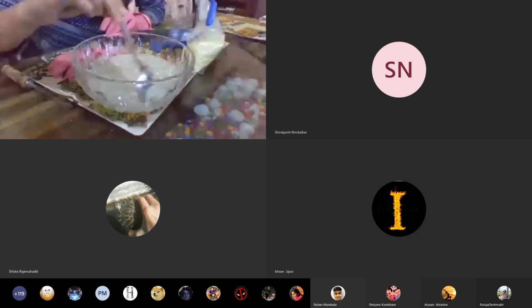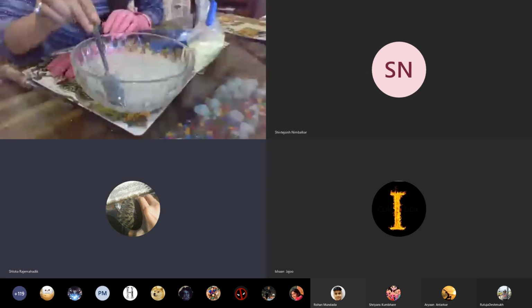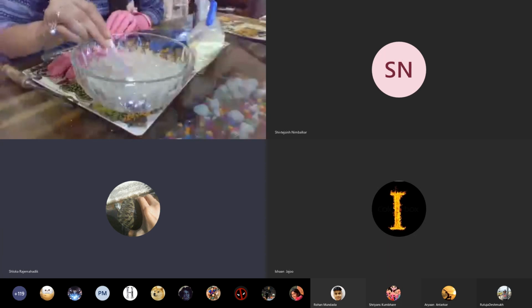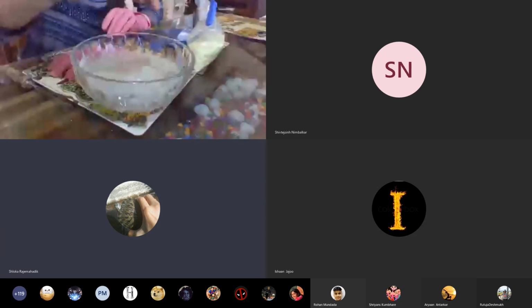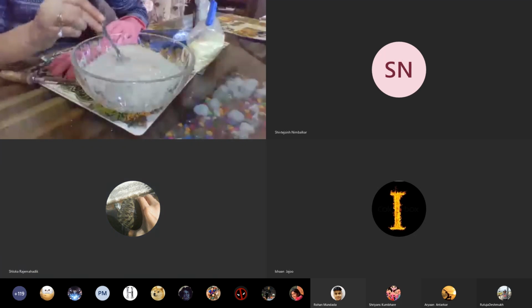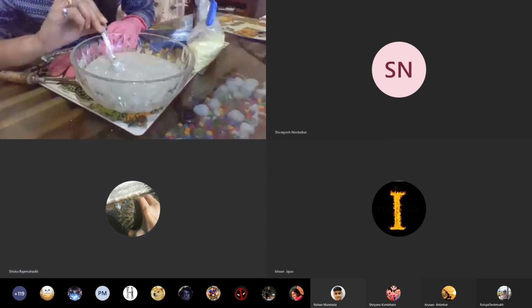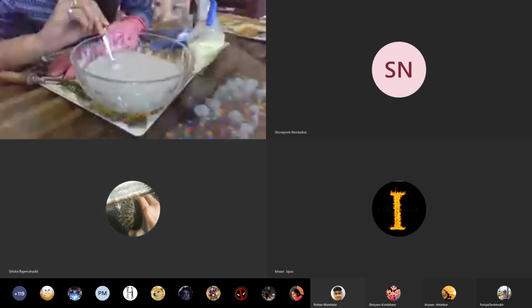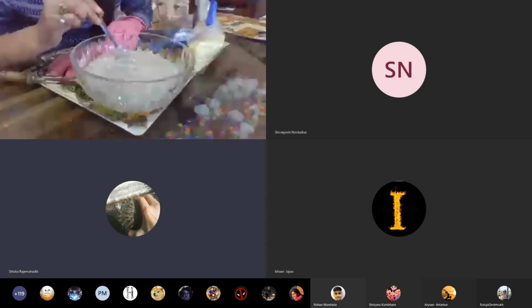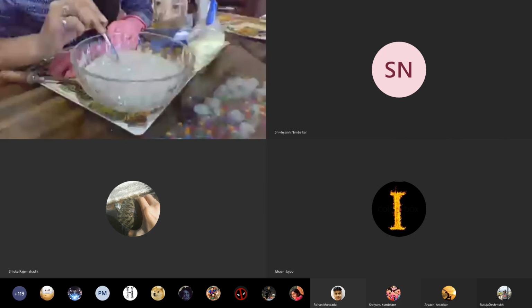So here now sulfur is reacting with sodium hydroxide. Can you note down the reaction? Okay, in the earlier ones: sulfur plus sulfuric acid, arrow, no reaction. Sulfur plus water, no reaction. And sulfur plus sodium hydroxide. Now this is the last reaction, please note it down.